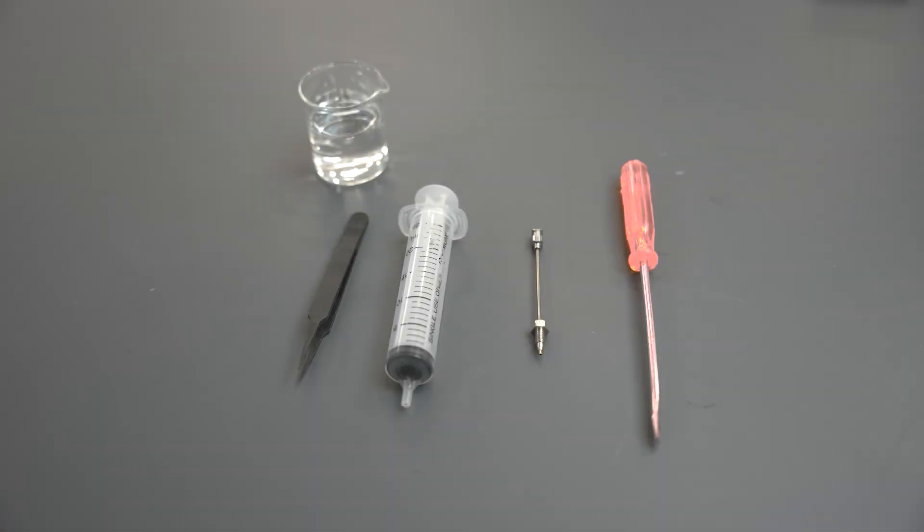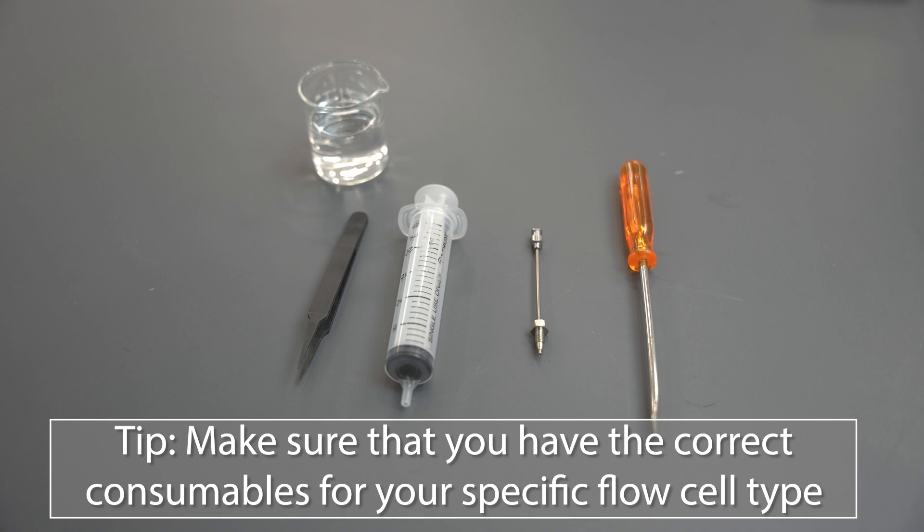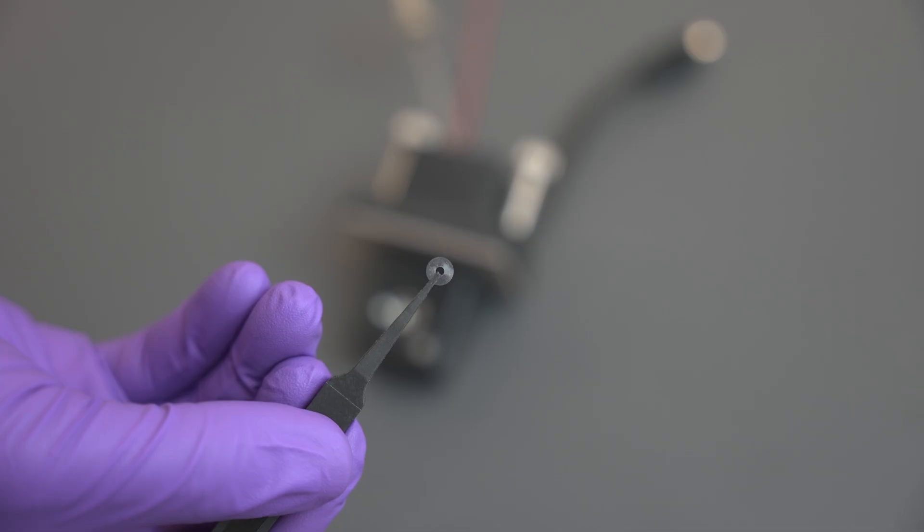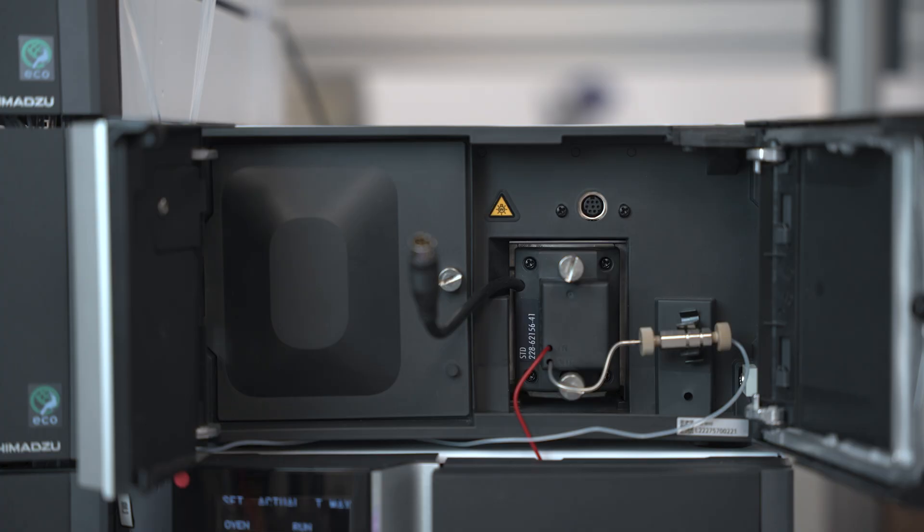For this procedure, you will need a flathead screwdriver, plastic tweezers, a syringe that has a needle with a nut and ferrule, 2-propanol, and replacement lenses and gaskets. Make sure that you have the correct consumables for your specific flow cell type. Please note that there are two gaskets that come with the applicable part number. Confirm that you see both gaskets in the bag before opening it.